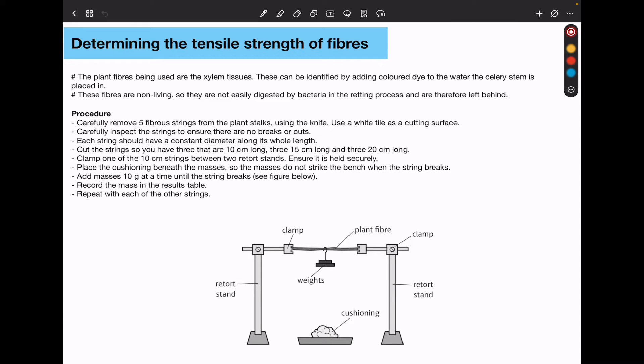After these fibers are obtained, we're going to use a knife to gather fibers. We have to make sure the fibers have the same diameter. The only difference here is maybe the fibers from different plants, but everything else has to be the same. The diameter has to be the same. The length has to be the same. So the only variation is going to be they're from different plant materials.